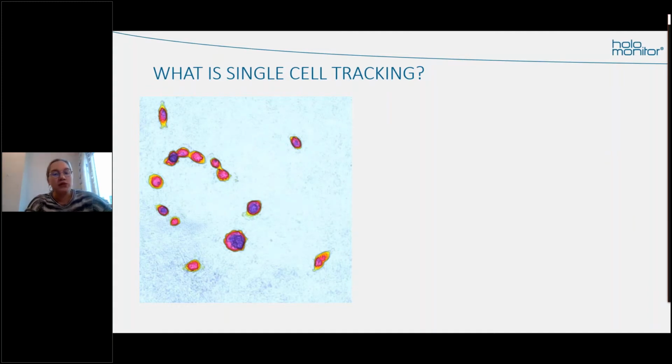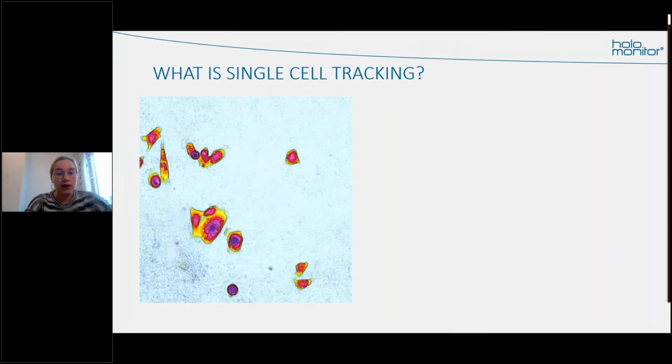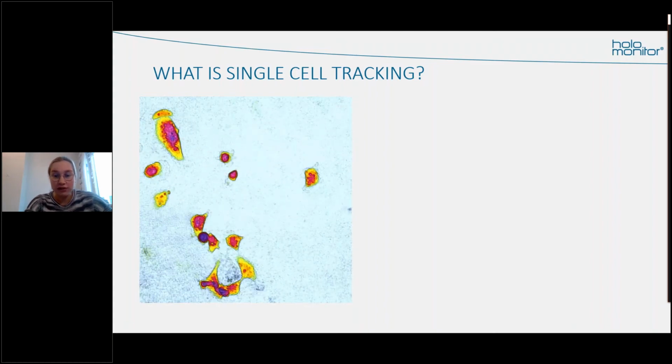So that brings us to the first topic of this webinar. What is single cell tracking? Single cell tracking is to follow a cell over time and study what is happening to them during that time, both when it comes to cell behavior, like how they move and divide or don't divide, but also how they change in morphology. As you can see in this movie of MDA-MB231 breast cancer cells, some cells move more than others, and some cells are also thinner or thicker than other cells.